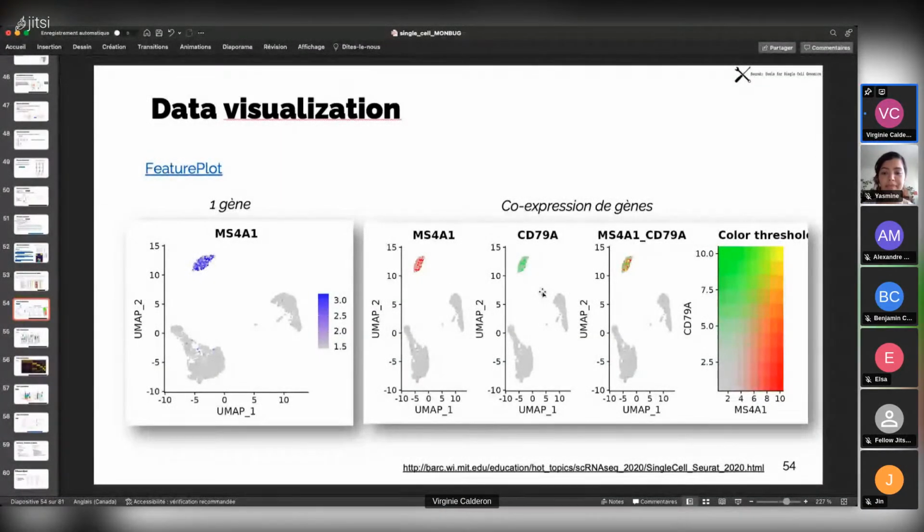Okay. So the legend on which one? About the color threshold, on the right. Yeah, the heat map. Here it's based on the expression of the two genes. If you have the same level of expression in the two, the color code will be the same; if you have 5 in one, you will have this color if you have 5 also in the other.